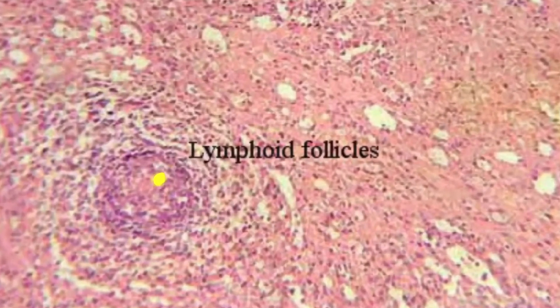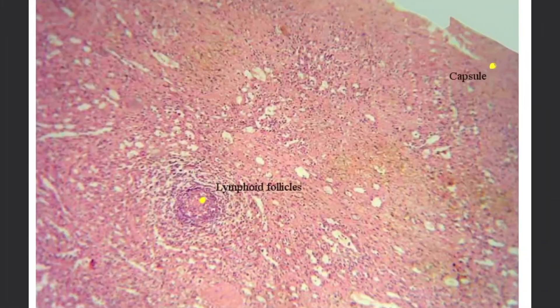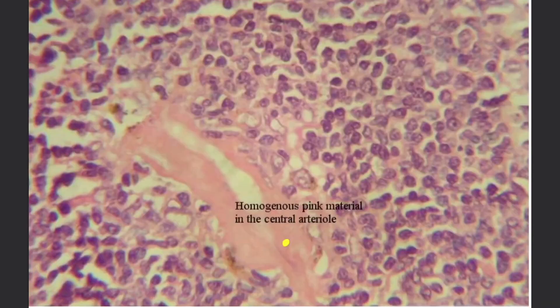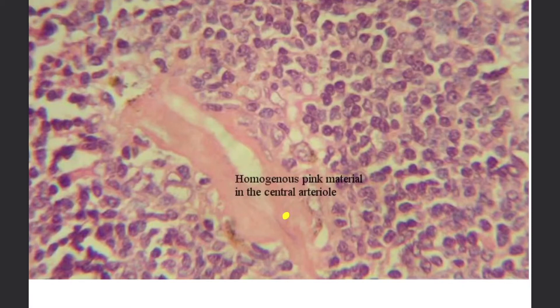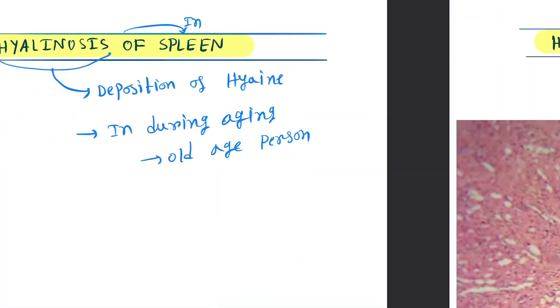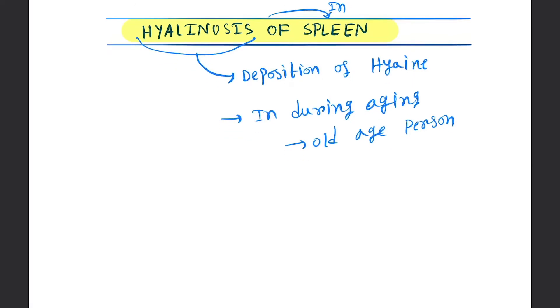The next feature is the homogeneous pink material in the central arteriole. In the central arteriole, a homogeneous pink material is present.